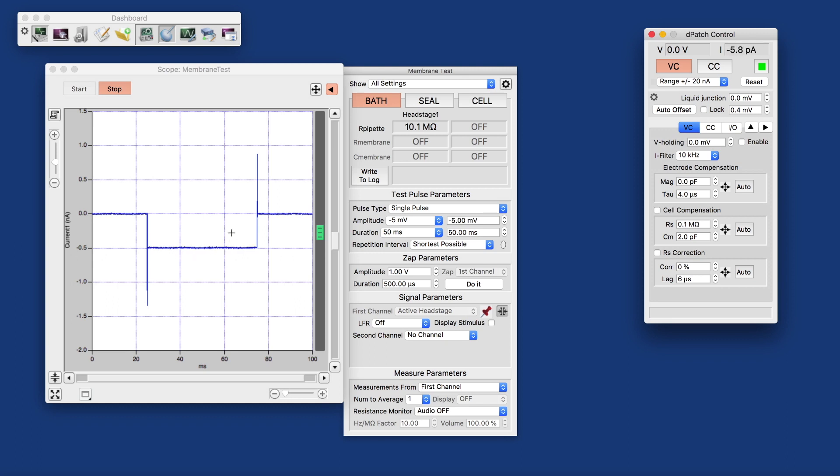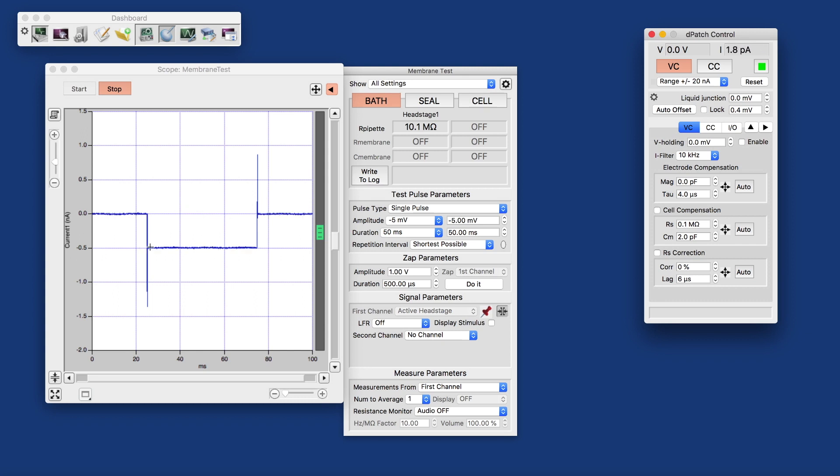We have a model cell connected, switched to the bath position. That means we're simulating a 10-megohm pipette being in the bath. And since we don't have a Faraday cage here, we see a little bit of line frequency hum here. We'll deal with that later.